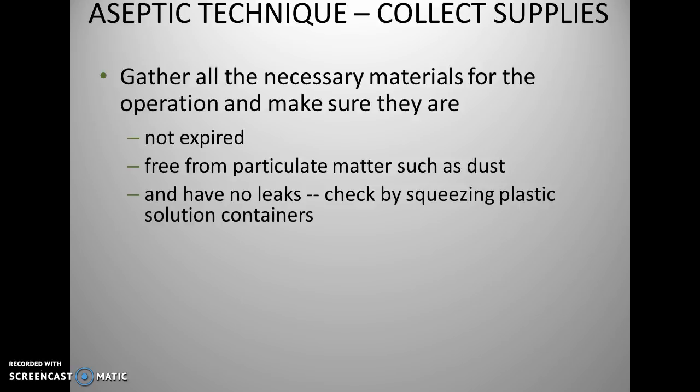So when you're working with an aseptic situation or technique associated with a hood or cabinet, you want to make sure that everything you need to do to your compounding or to work with that particular prescription or medication is all in one place. Okay, gather all of the necessary materials for operation. Make sure that they are, 1, not expired. Sometimes you have to wipe them down with alcohol because you don't want dust.